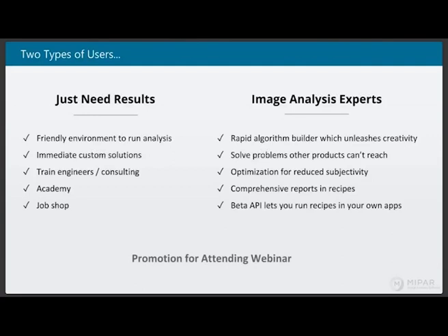We've also had success using our color cluster tool, where you simply input the number of colors that you're trying to discriminate. That's literally the only step. And the software will then use a k-means clustering algorithm in RGB color space, and without any other parameters, objectively determine where the boundaries between those 4 colors lie and split up the image for you into your 4 classes. That's been a repeatable and objective solution that we found to some of these color segmentation problems.